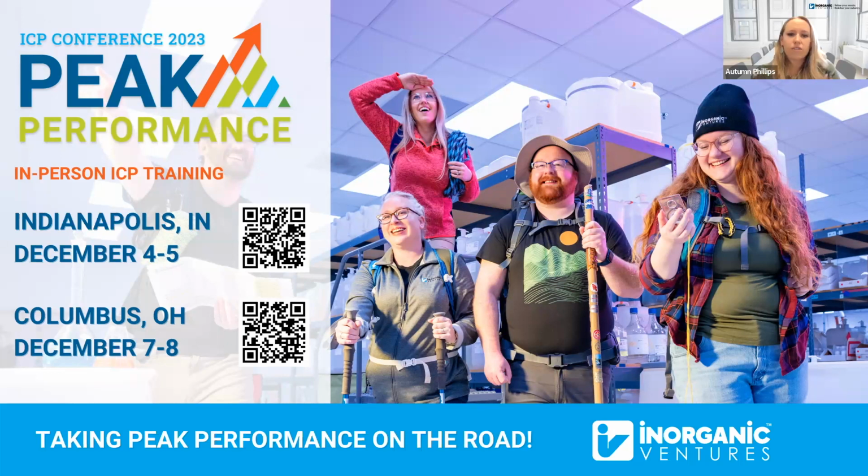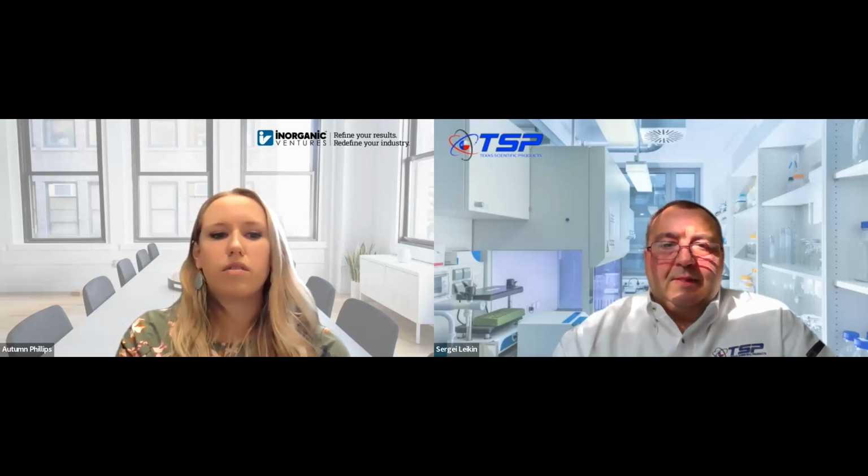Lead isn't actually a huge concern for glass, so maybe you're thinking of a different analyte. For glass, the typical concerns are aluminum, barium, obviously boron, calcium, gallium, iron, nickel, potassium, sodium, strontium, zinc, and zirconium. Any type of trace analysis with any of those elements, we would generally try to package in LDPE, which is the cleanest container material. But lead shouldn't really be a concern for glass.